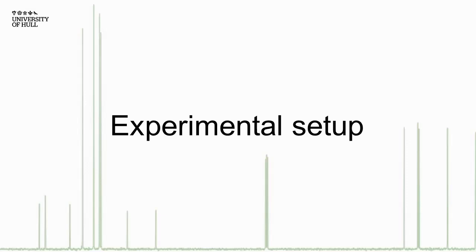This video is going to go through fluorine decoupling, how to set up the experiments, how to process the basic 1D NMR data, and how to superimpose the data to allow for the decoupling to be seen. To begin, we're going to start with the experimental setup.